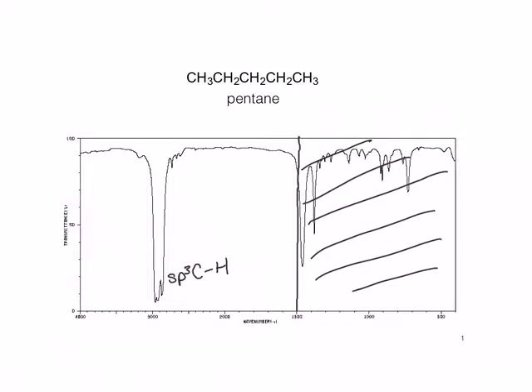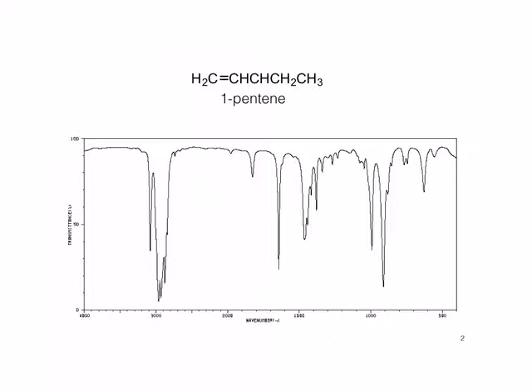Next, we'll look at the spectrum for pentene, which has a double bond, and you can see the difference. Now in addition to our SP3 carbon-hydrogen stretching, we now see SP2 carbon-hydrogen stretches. We also see a carbon-carbon double bond stretch at about 1640. The stretch at about 1800 is probably just an impurity and is not due to one pentene.